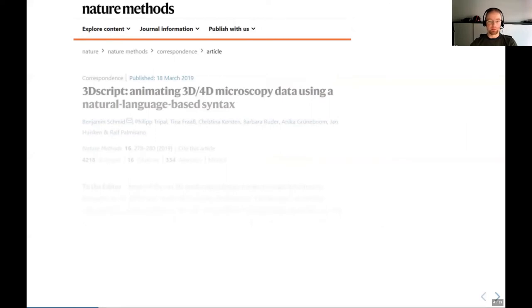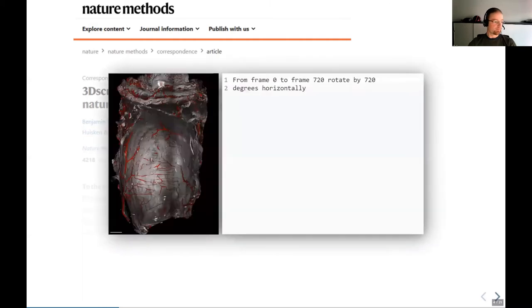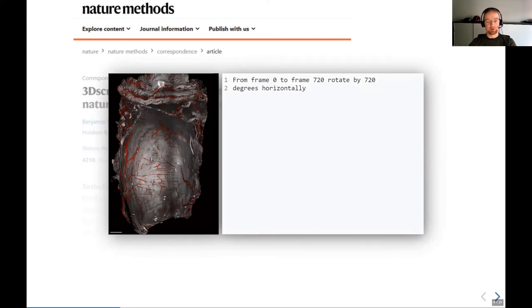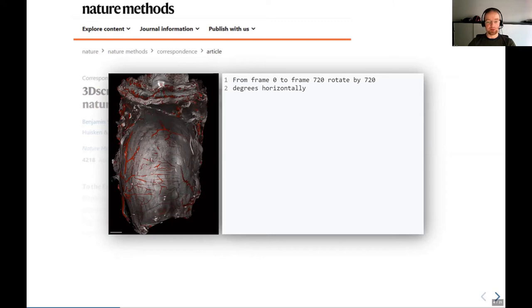So it is a software for 3D animation that is not based on keyframes, but instead just normal human readable text describes and fully specifies individual transitions. Like here's an example. This could, for example, be from frame zero to frame 720 rotate by 720 degrees horizontally. This sentence would now mean we create the movie with 720 frames, and within the 720 frames the object rotates twice, so 720 degrees horizontally around its vertical axis.